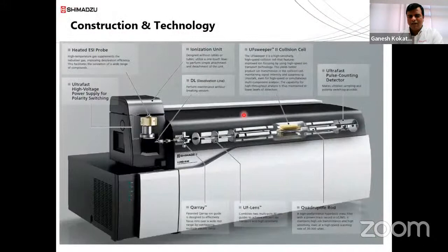Now, if you are focusing in detail on the MS, I will just draw how it is constructed basically. So we require this, called ESI. Okay, any probe, either ESI or APCI. The mobile phase coming from the HPLC, we need to put it over here. After putting this mobile phase over here, there is one capillary inside this ESI, which we call the ESI capillary, having a dimension of hardly 0.3 mm ID, not more than that. Along with that capillary, there is one gas we call the nebulization gas. It passes from the source of ESI as well, and it forms sprinklers. You may call it nebulization happening over here.